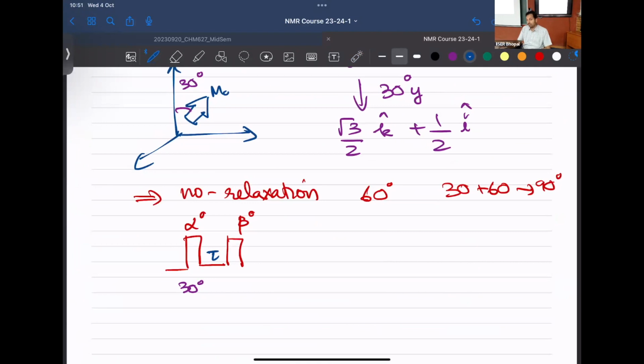The sensitivity is going to be so shunted. The reason why we learned the semi-classical picture and quantum picture, and now this part of it, is so that you carefully tune your experiment. The example that you're trying to ask is a classic example of getting a carbon 1D NMR spectrum where the T1 times will span several seconds. Okay, the T1 will be several seconds.